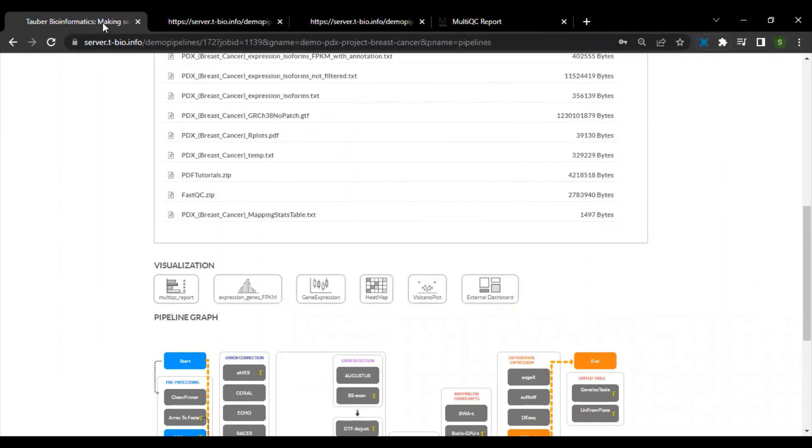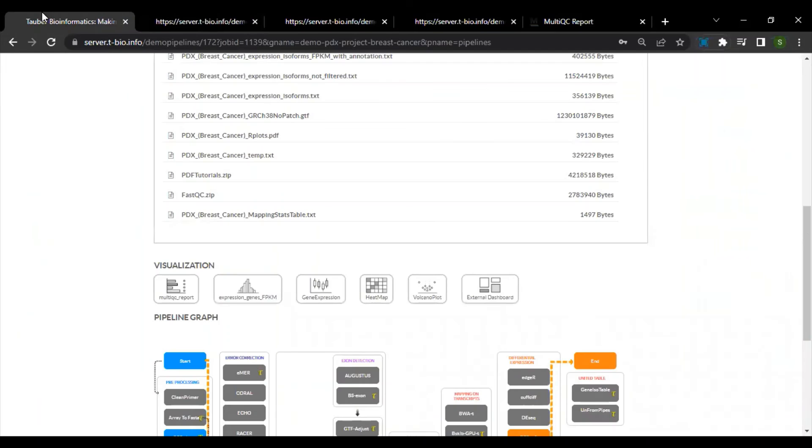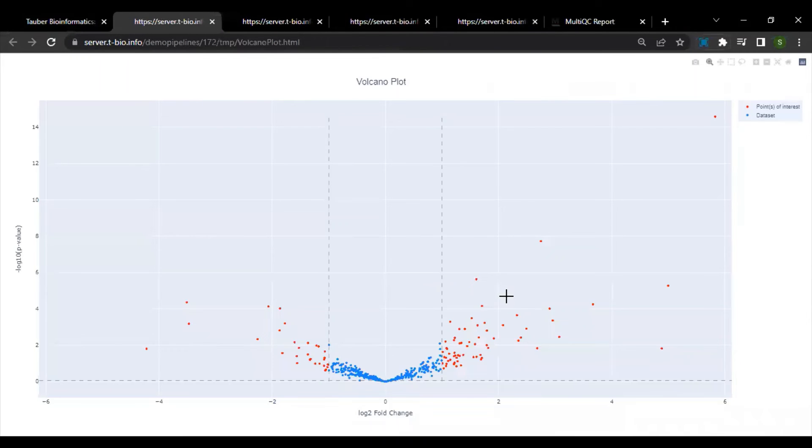Another important visualization is that of the heat map. We also have an interactive volcano plot with the significantly expressed genes depicted in red color.